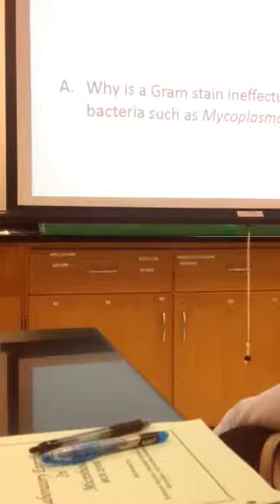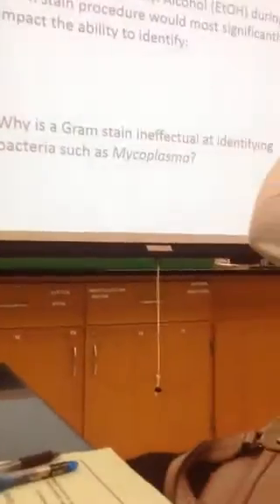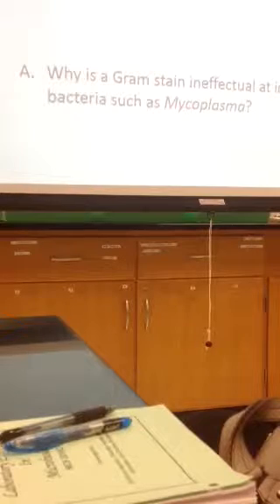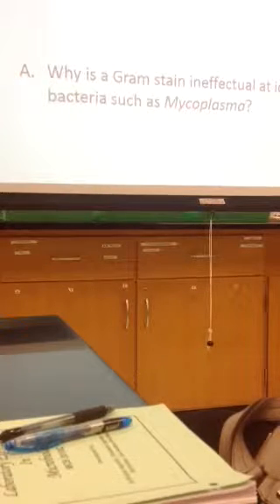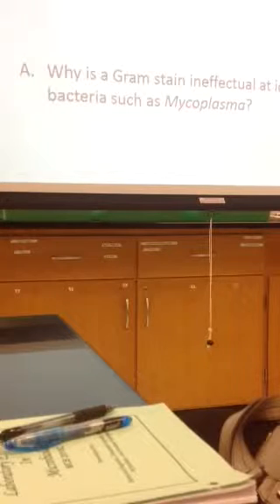Why does the gram stain not work on mycoplasma? Because it's a wax. What is the gram stain supposed to point out? The cell wall. Does mycoplasma have one? No. So mycoplasma has no cell wall, it won't work. Okay, that's what I'm looking for. You need heat. Well, you need a completely different staining technique for that one. It wouldn't work at all.